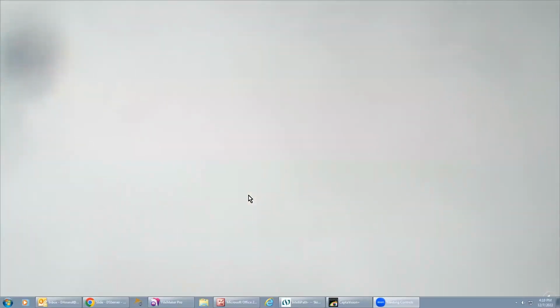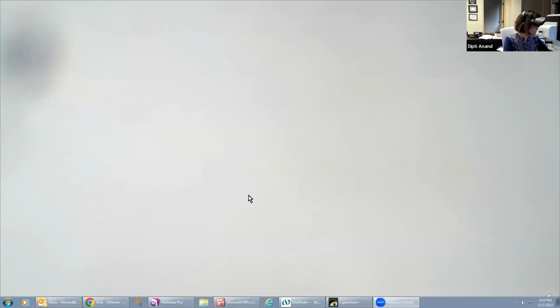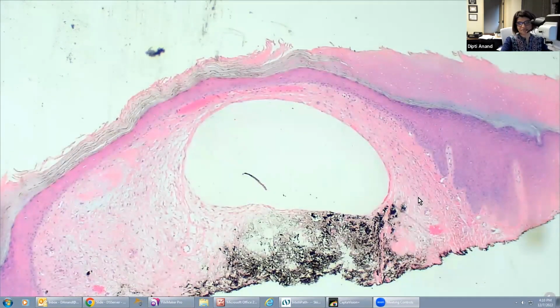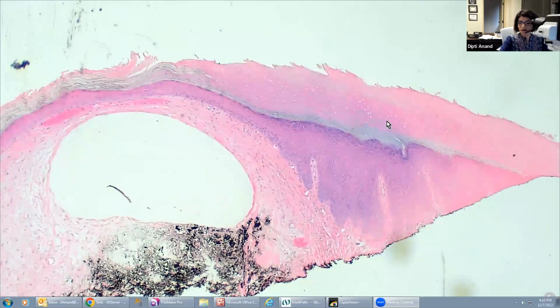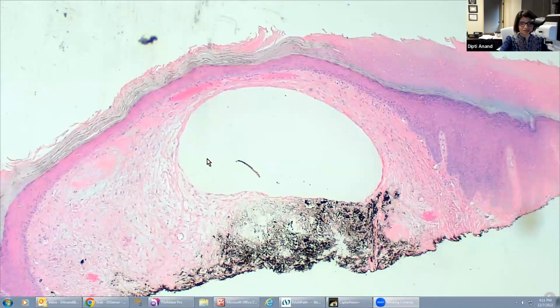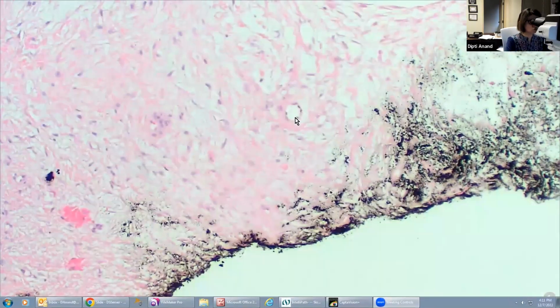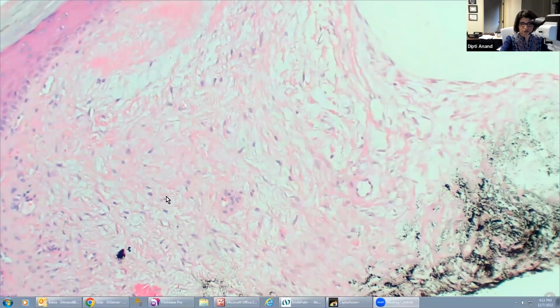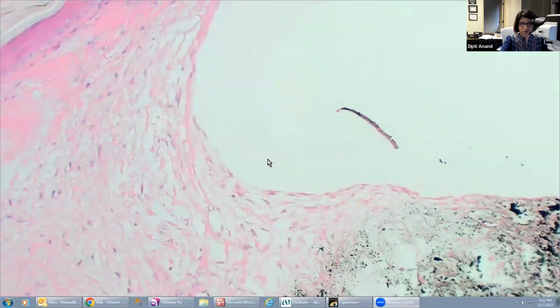Okay. So the next entity with mucin deposition, which is, again, a tumoral entity, is your digital mucus cyst or a pseudocyst. So this is not really a true cyst, and it has, again, a classic presentation. You often see it on the acral skin. So you will see the biopsy of the acral skin. The epidermis overlying the pseudocystic lesion is kind of thinned out, and you see this kind of a bubble-like space, which is formed because of mucinous degeneration of the stroma, but there is no true cyst lining. And the adjacent stroma will show these kind of angulated fibroblasts again with mucin deposition.